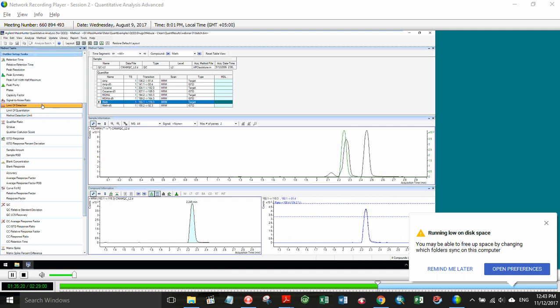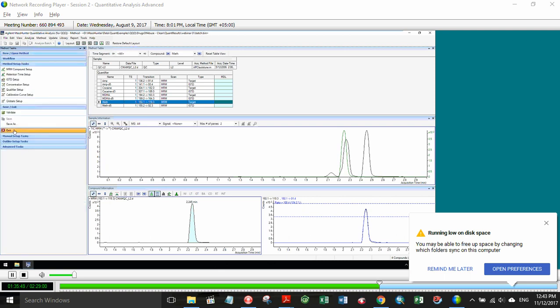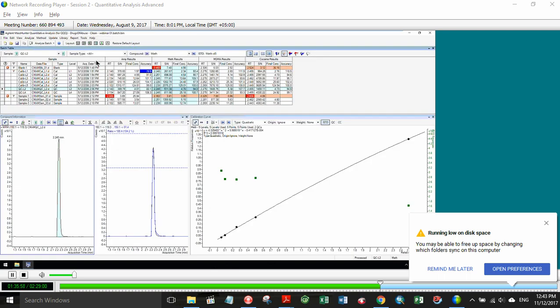Okay, and I have one last question, and then Steve will get back to you. And just because we're right here, would you please show how to add user-defined columns and which parameters can be used as user-defined? User-defined columns. All right, if we want to add those, typically they're added in the batch table. Oh, pardon me. That's okay. Again, we're running into some issues with the user-defined. What do you want to user-define here? And that's why I think what we're going to try to do here is to address this offline.